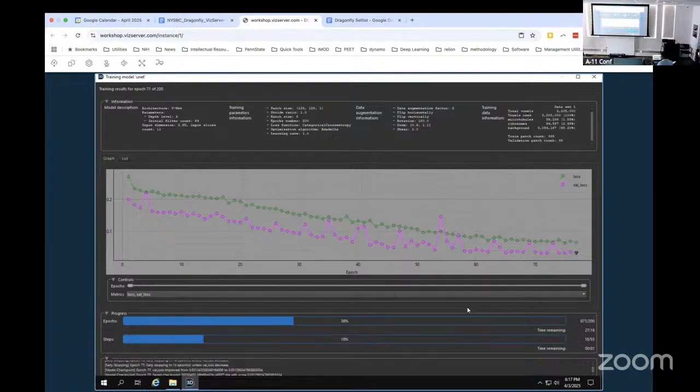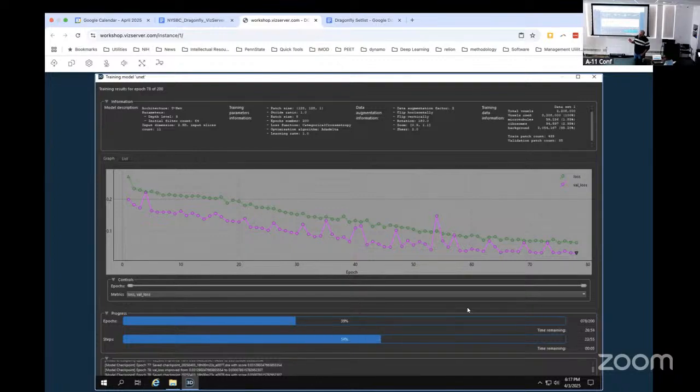If we use our own data, how should we set up the crop size? And how many do you think the network will need to train? I tried to show you what I think is the minimum, little things like copy and paste. The more the better, but it takes time.